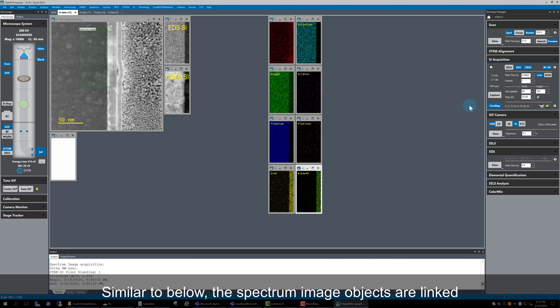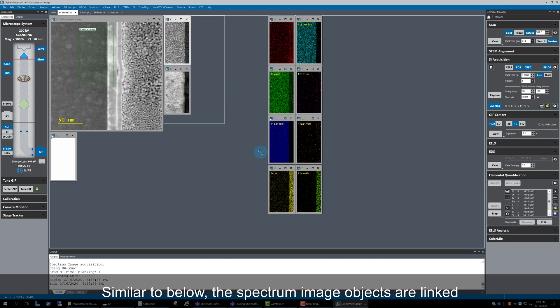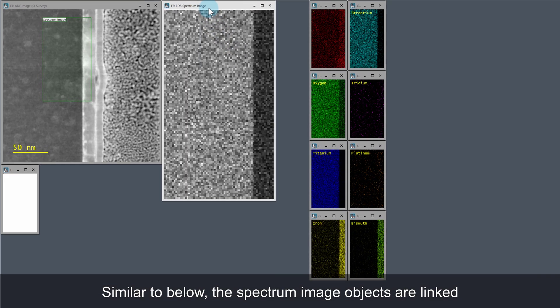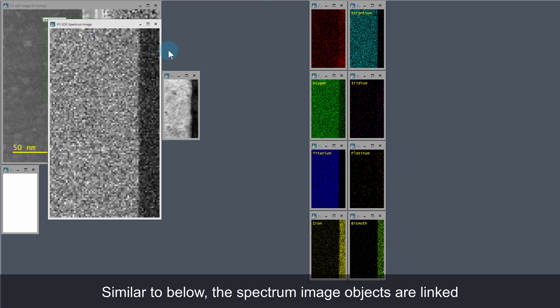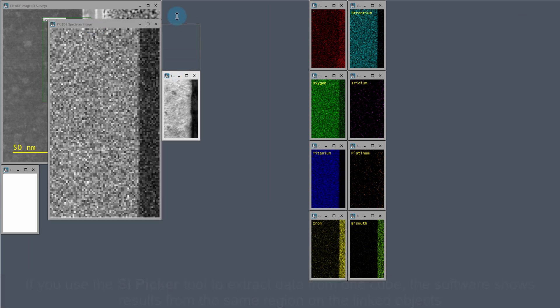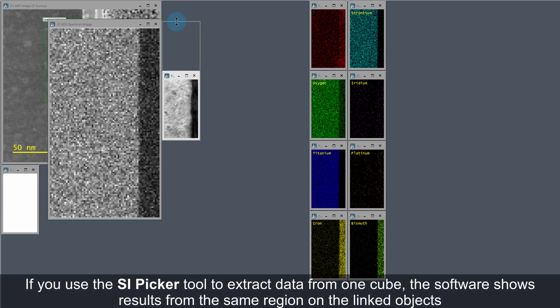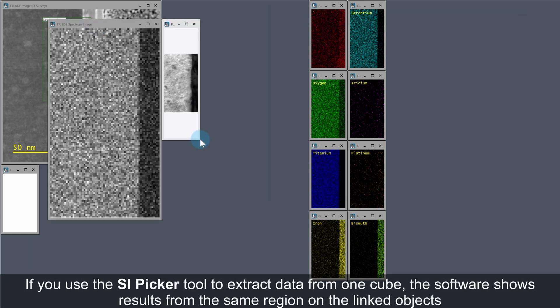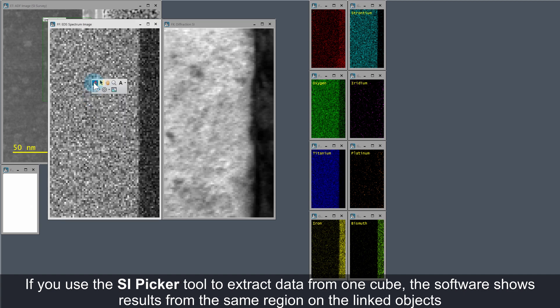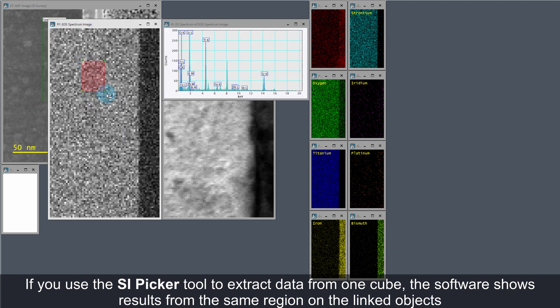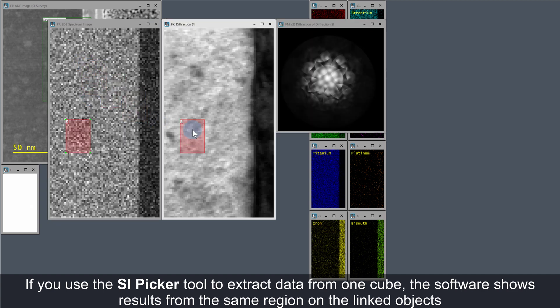Again, as before, the spectrum image objects that were just acquired are linked. If the SI picker tool is used to extract data from one of the cubes, the software will automatically show the data from the equivalent pixels of the linked object or objects.